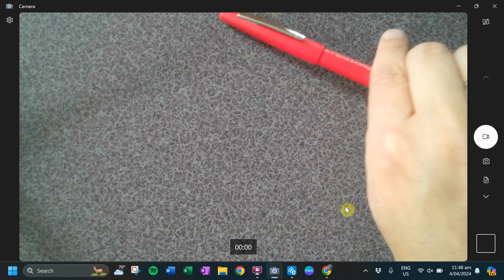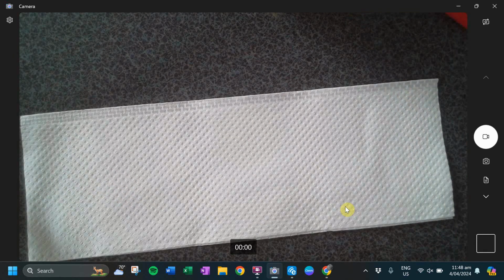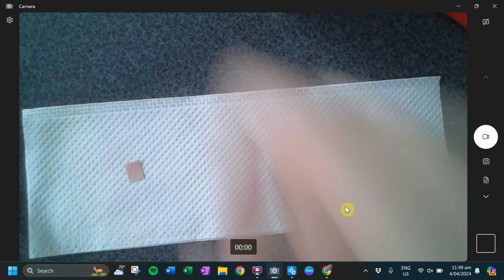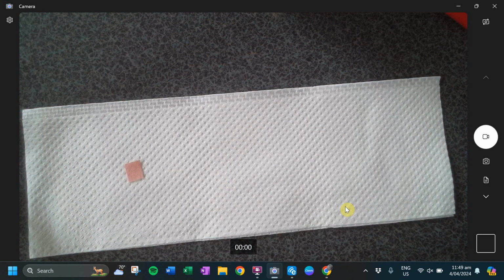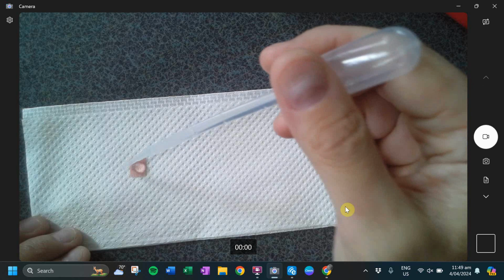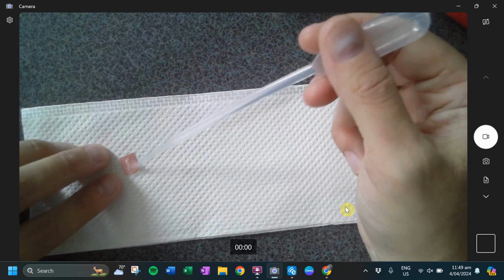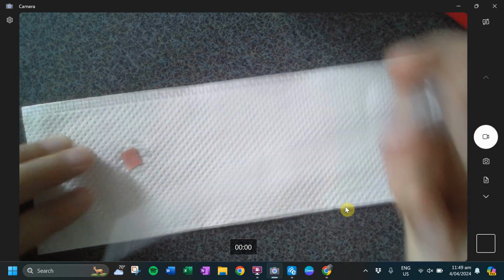What you are going to do, and you're going to do this with me so we can learn together, is look for the red litmus paper. We are taking one of the red litmus papers out. These are chopped into small pieces because you don't need the whole thing. And we are taking a little bit of our unknown, and we are adding it to see what color it changes to. Now don't use all of it. You don't need all of it. There you go.